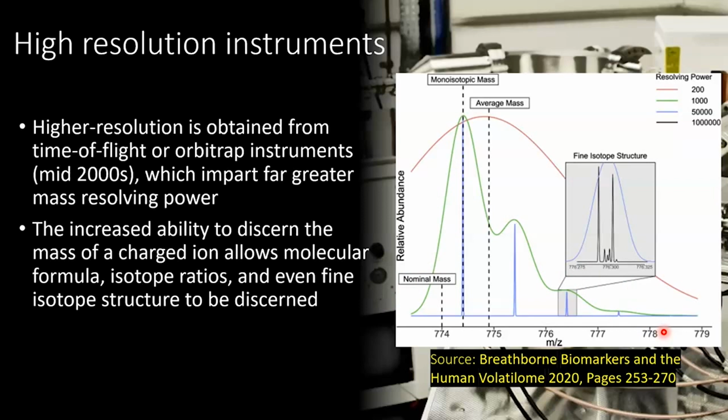For most molecular fragments, it will break down into something that looks like this, and these are the different isotopic forms of carbon, which are in relatively high abundance. Similarly, with the halogens, bromine is a good example. Bromine has 2 isotopes in approximately 50-50 percentage abundance, so you would start to see a 1-to-1 doublet resolving if you had a bromine atom within it.